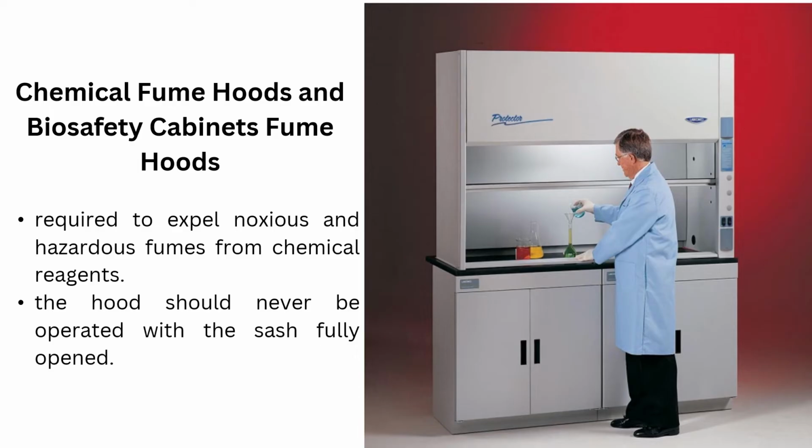As an added precaution, smoke testing is recommended to locate no-flow or turbulent areas in the working space, and personal air monitoring should be conducted in accordance with the chemical hygiene plan of the facility.